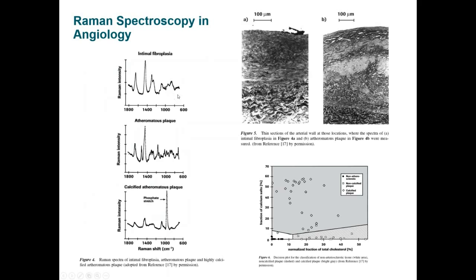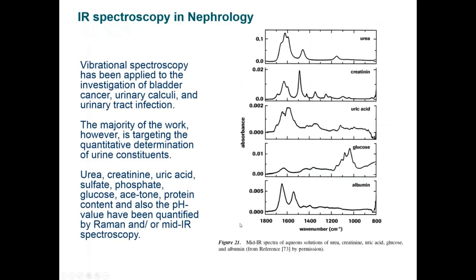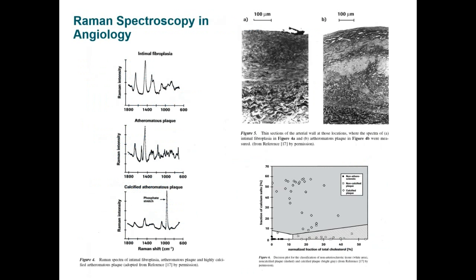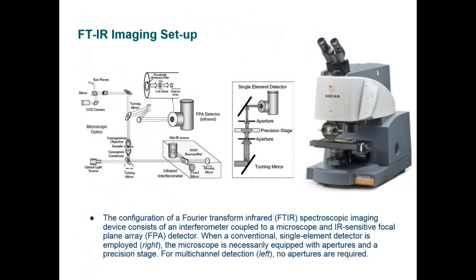On the other hand, with Raman, you can use Raman spectroscopy combined with Raman imaging to look at the presence of Raman-sensitive functional groups, and those are typically phenyl rings, double bonds, or particular frequencies that are not readily observed by IR, as you can see in the range where Raman is very sensitive compared to IR. Of course, X-rays are used very much for structural biology. So from spectroscopy, let's go to imaging. In imaging, obviously, we can talk about scanning electron microscopy.